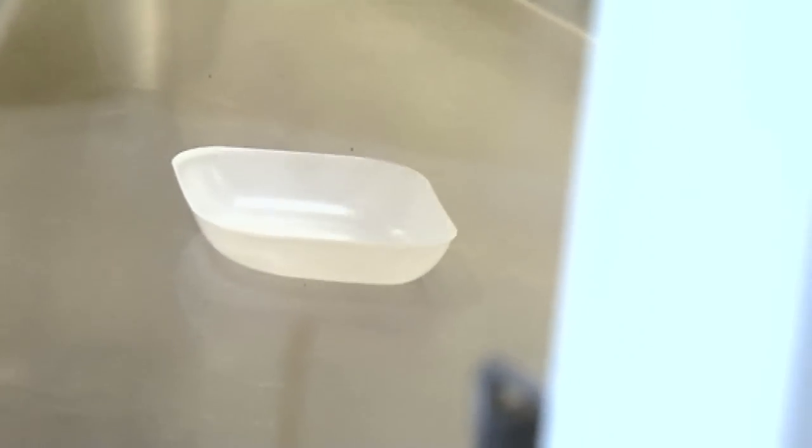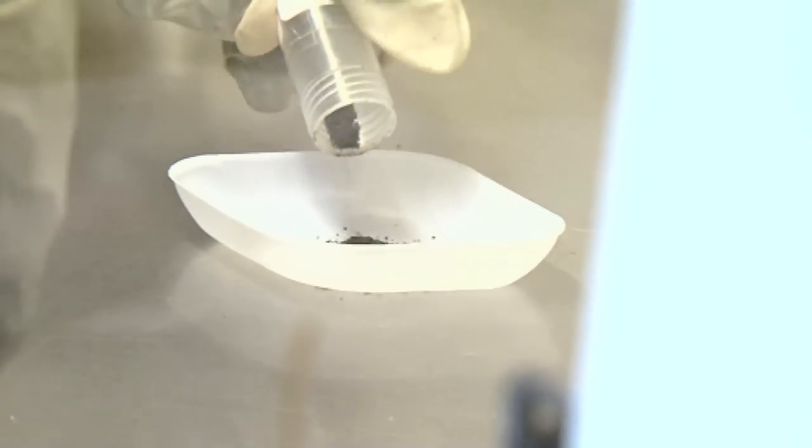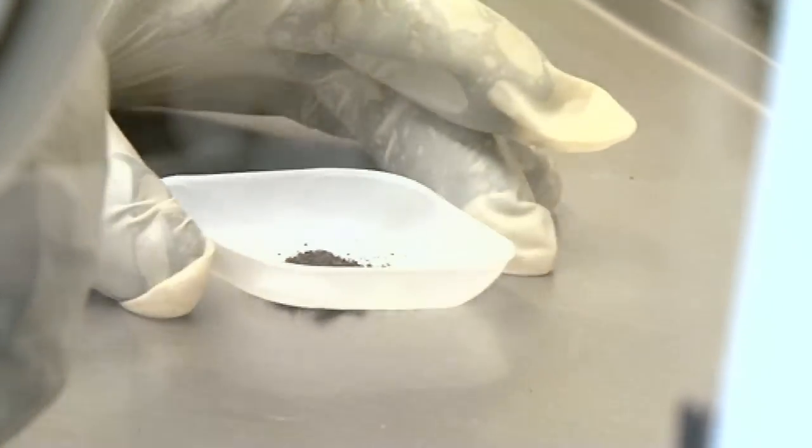Dave has some of this nitride compound in this little vial which we've kept stored in the fridge freezer in the box just to make sure it's okay. And it's all under an atmosphere of nitrogen, dry nitrogen in this box to stop it going off because it reacts with water and oxygen which is in the air that you and I breathe all the time.